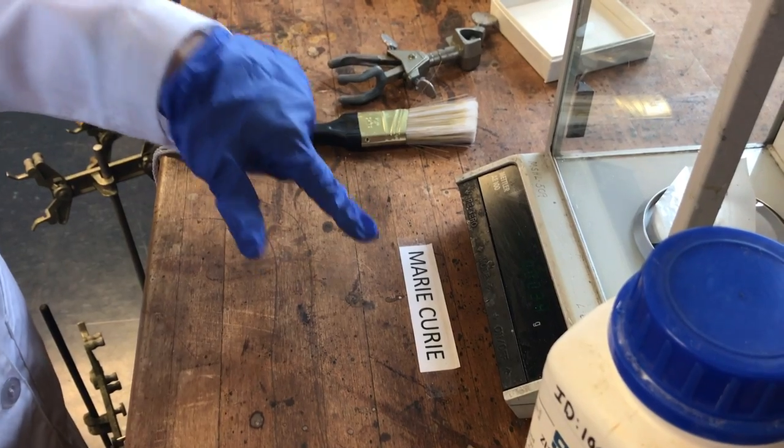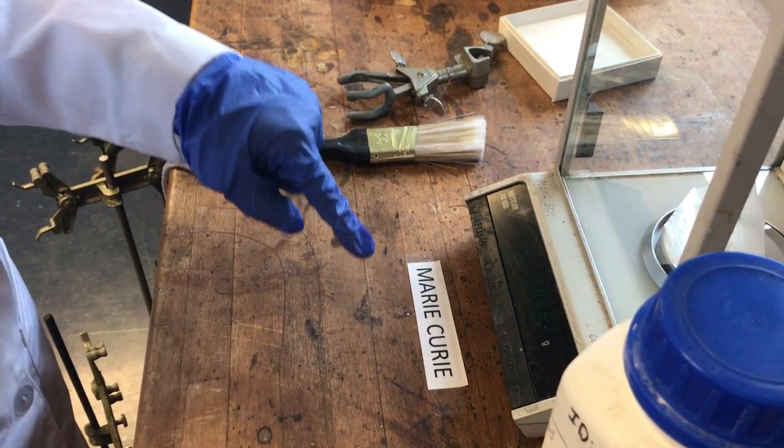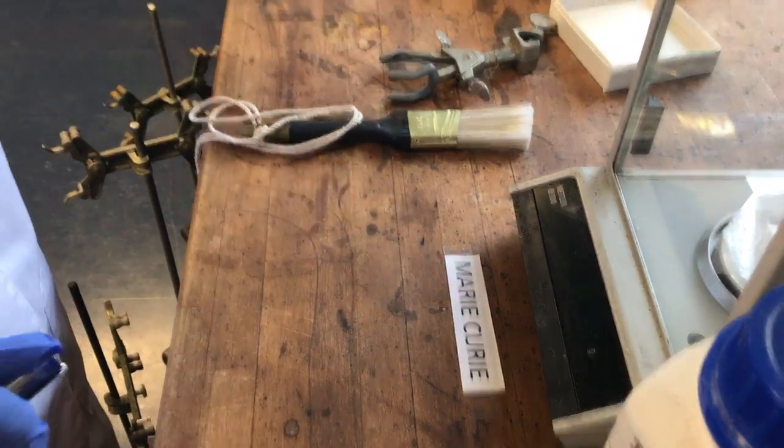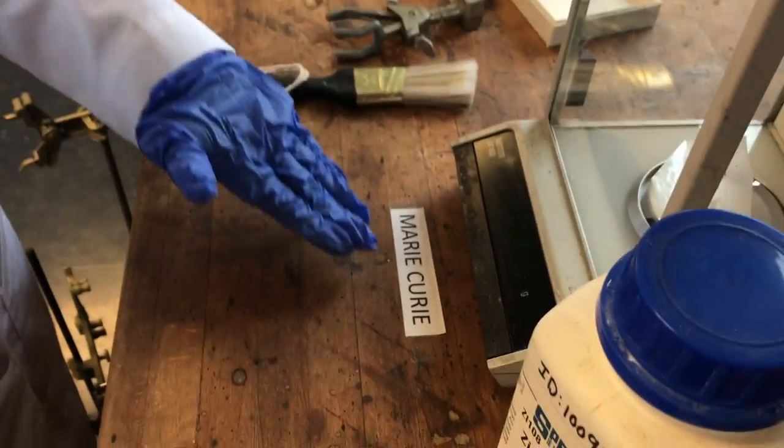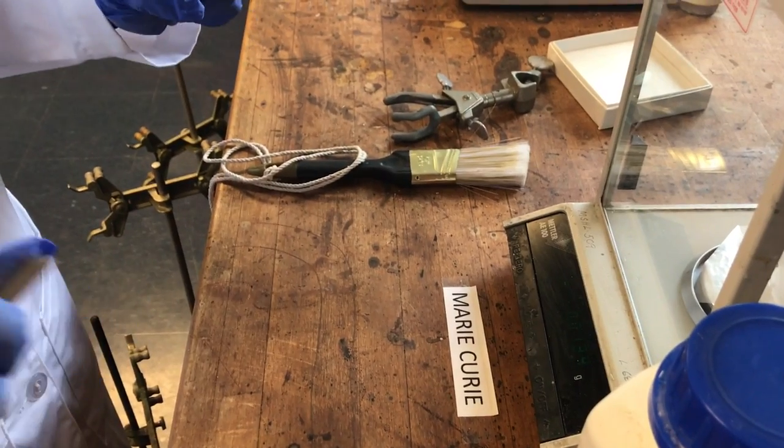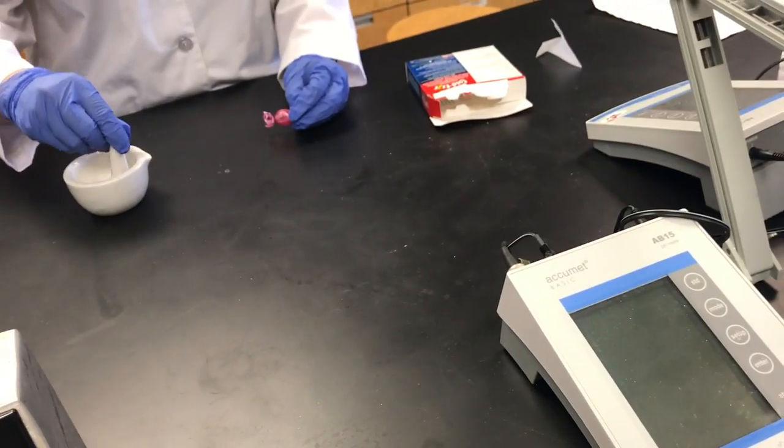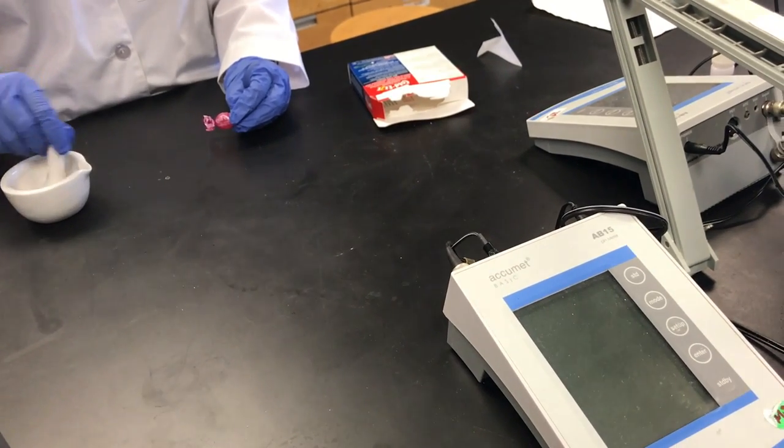Okay, also shout out to Dr. Fey, who some of you may have as your lab instructor. She took the time to label the analytical balances with famous women scientists. Mortar and pestle, I don't see any matching places.